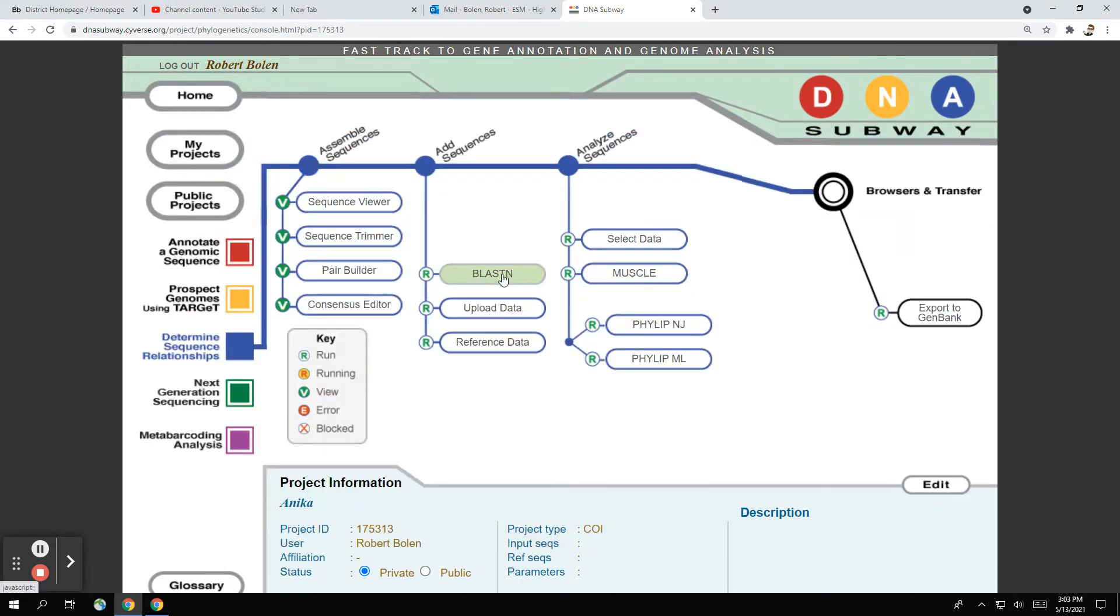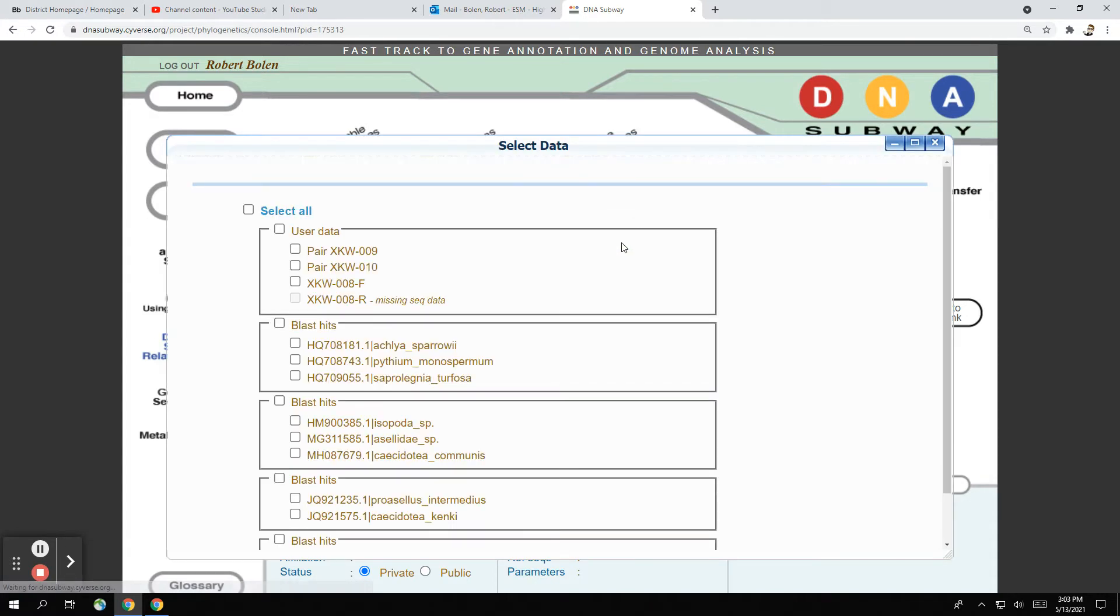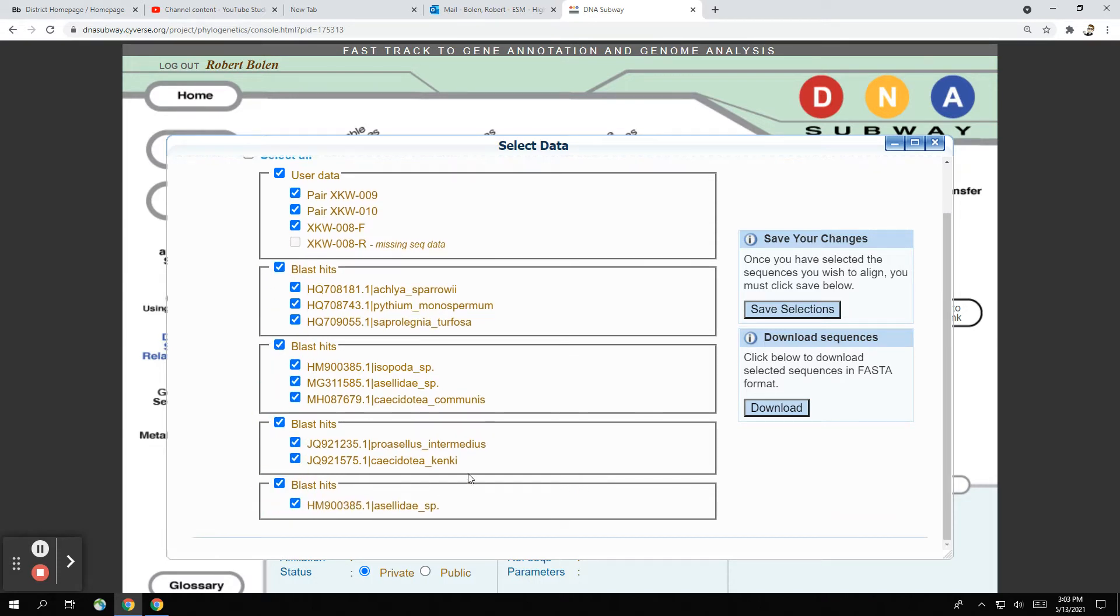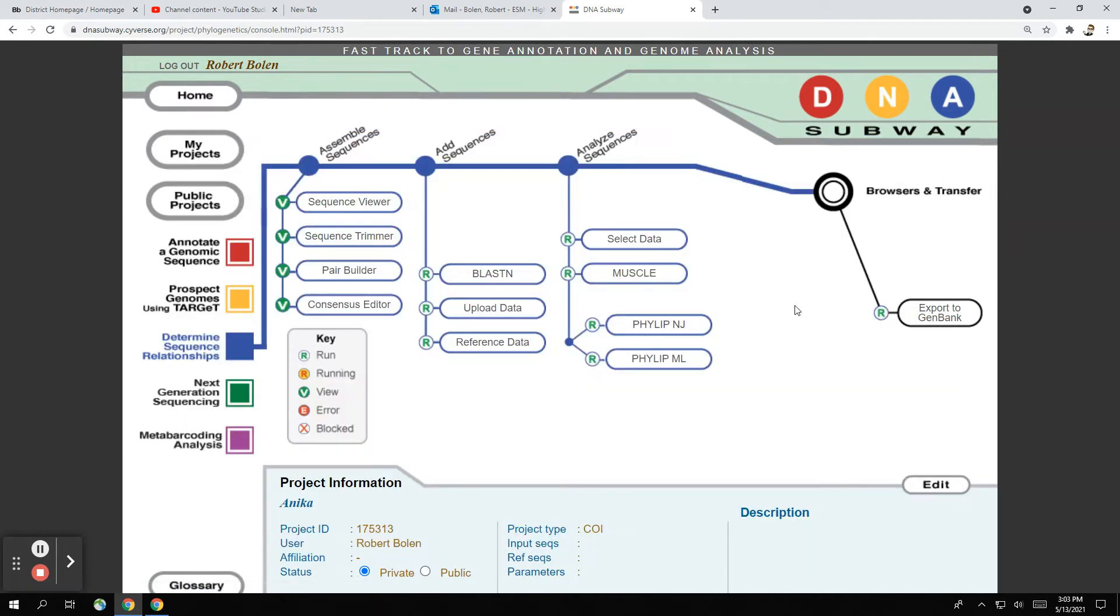So the next thing you're going to do is go to select data. We're going to skip upload and reference. Go to select data. And we're going to pick our user data, which is all the sequences that we got. And we're going to hit all of our blast hits to see who's related to who. Once you do this, you click save selections.